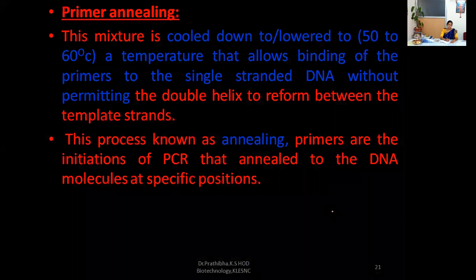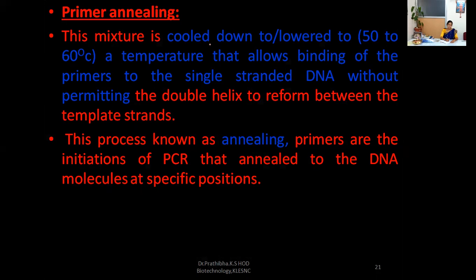Now coming to primer annealing. You know the definition of the primer. Now let us understand what primer annealing is. In primer annealing, the mixture is cooled down to 50 to 60 degrees Celsius, a temperature that allows binding of the primers to the single stranded DNA without permitting the double helix to reform between the template strands.